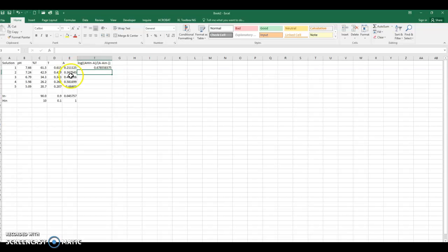Okay, so now when I drag this down, it'll do the calculation correctly. If I go from here, it's E2, right, because I'm using this absorbance, and E8 and E9, which are down here, these absorbances. If I go down to the next cell, it's changed from E2 to E3, which is what I want, but it kept the E9 fixed, so it's still going to use those correct values there. Okay, so that's quite handy.